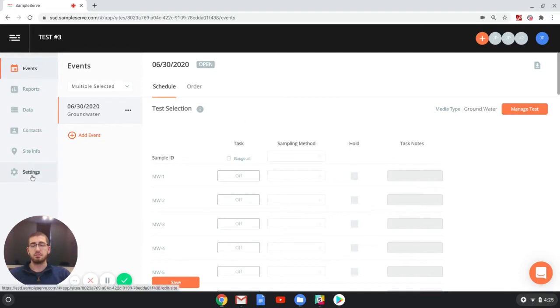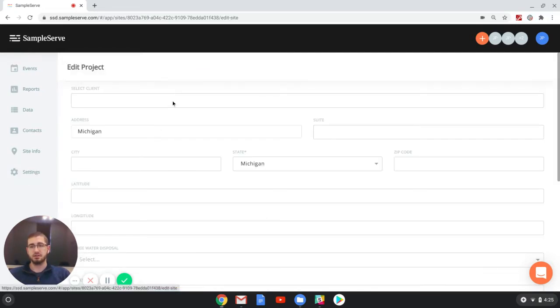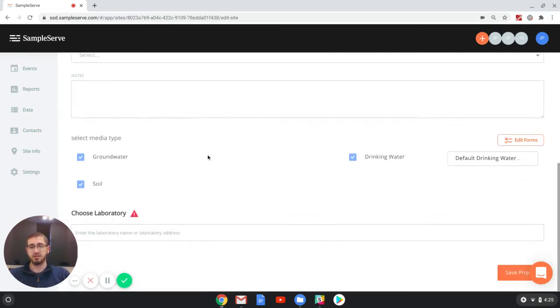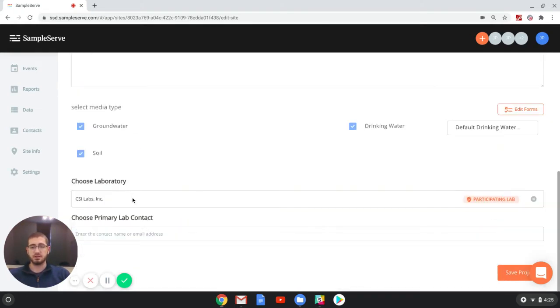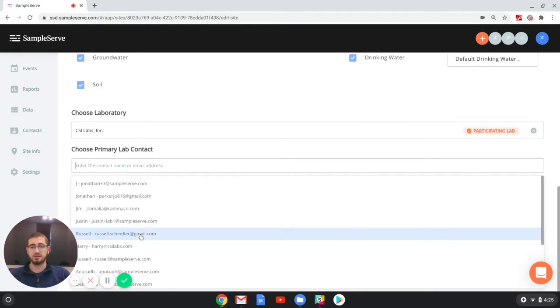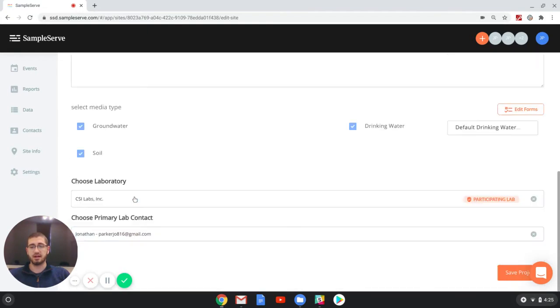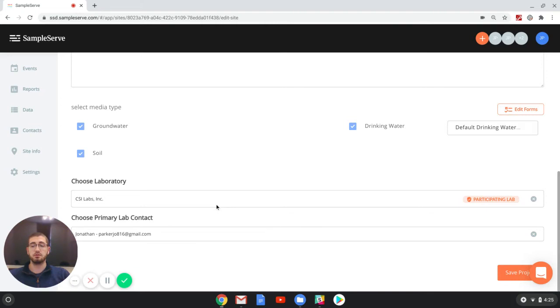When you first create a project, you'll see on your settings page that at the bottom you can select your laboratory right away. So we can go and select our laboratory and select our contact, and then we can save that, and that is the laboratory that this project will default to.